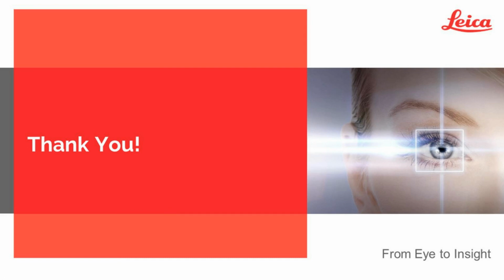All right. And our next question here, how do you align your images? How we do it is we have an in-house script that shifts the image pixel by pixel to find the matches. But there are other ways. I know there are some tools in ImageJ or Fiji that are available for doing the alignment. And in other cases, for our ground truth data, we also use the same system as well.